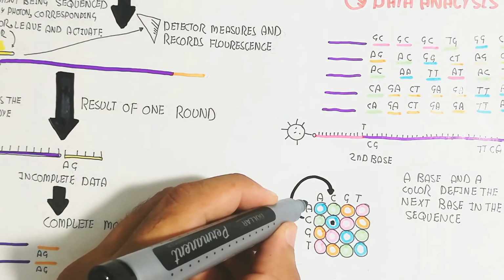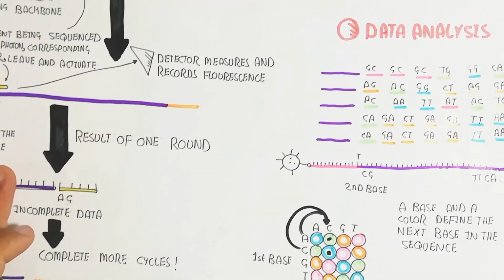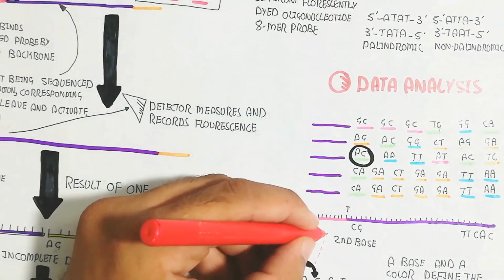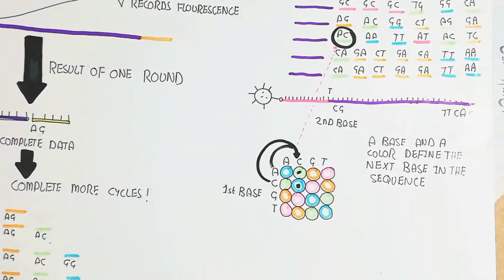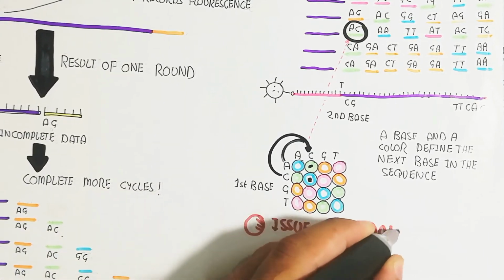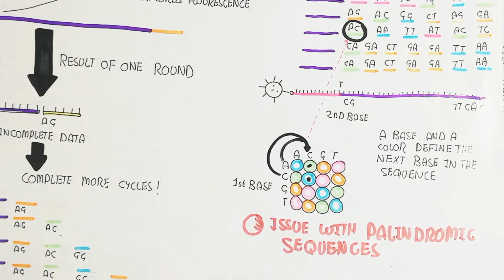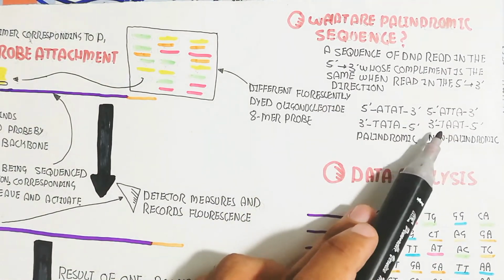In this way we can identify; here you can see the production of color, so I can match here. This is the AC which is used here. That is why it is green, because here is the AC, A into C, producing the green color. So this is the function of the base, the production of color, and the analysis.